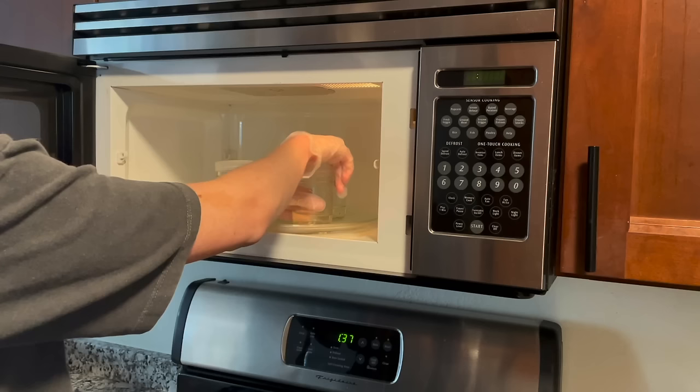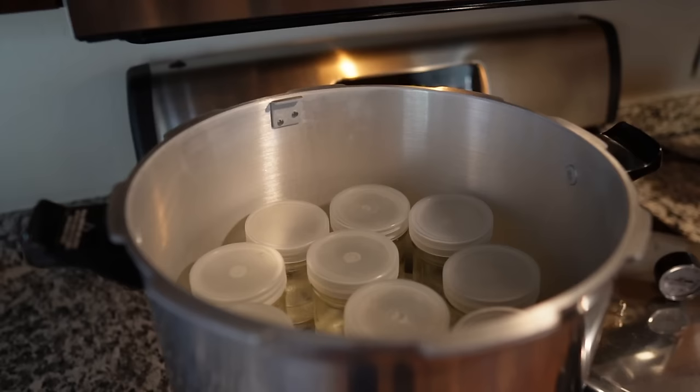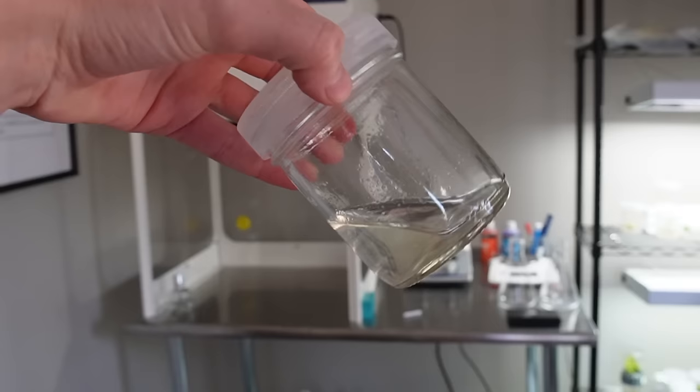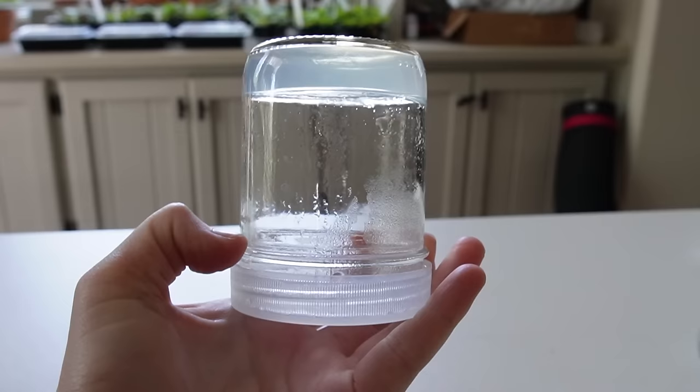Although microwaving media is the fastest and most convenient method, it's not optimal — you can still get contamination. The best way to sterilize tissue culture media is by autoclaving it in a pressure cooker at home. I have a video specifically on how to do this, but if it's your first time, the microwave is absolutely fine to try. After the media cools for a few hours it's ready to use, but ideally wait a few days to make sure no contaminants are growing in it. Now we are ready to tissue culture our plant, which is the fun part.